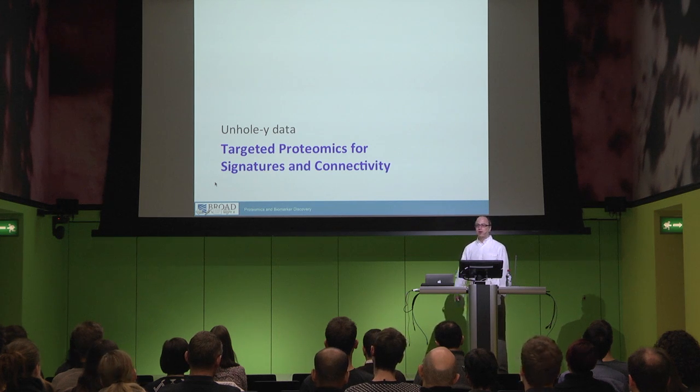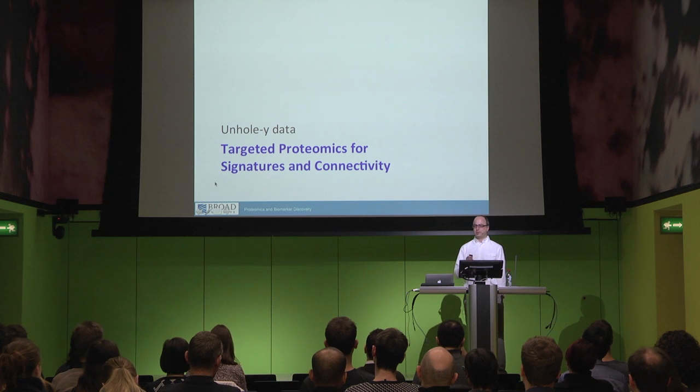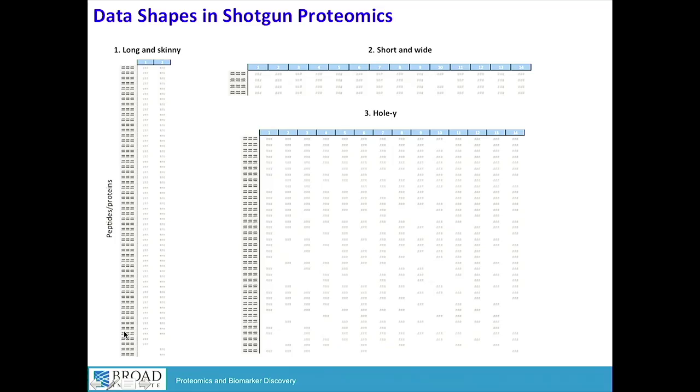Okay, so I was very gratified to see Rudy's talk on the first day of the course, where he talked about data shapes in proteomics, and I have quite a similar slide. I think most of you are familiar with this paradigm where if you're doing shotgun or discovery type proteomics, you can end up with a couple of different types of data shape. One is the long, skinny shape.